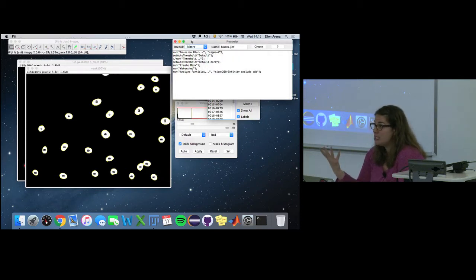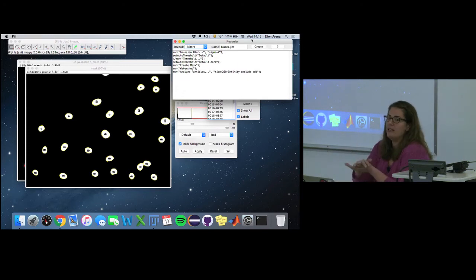So basically what we just did is create a nice little segmentation workflow. So now we can actually save this code. We can create our first, we call them, macros. Macros is the language itself, but if you have just a short little string of commands, people refer to that in the ImageJ world as a macro, right? Yeah. So we're going to create.